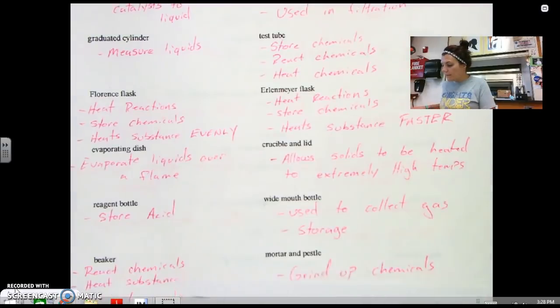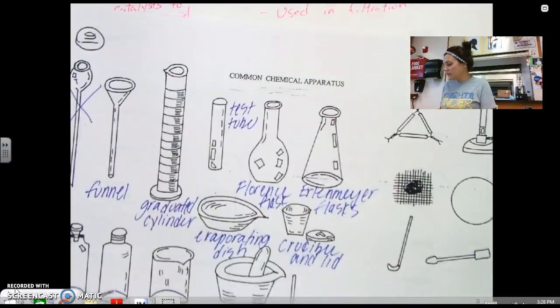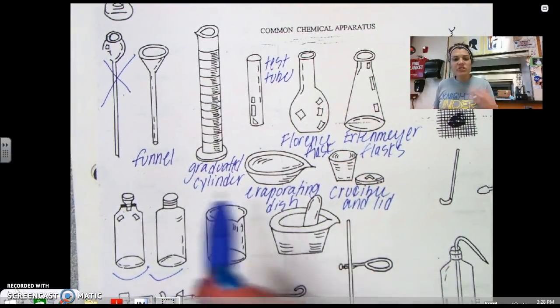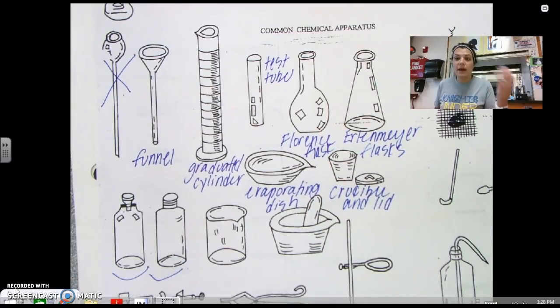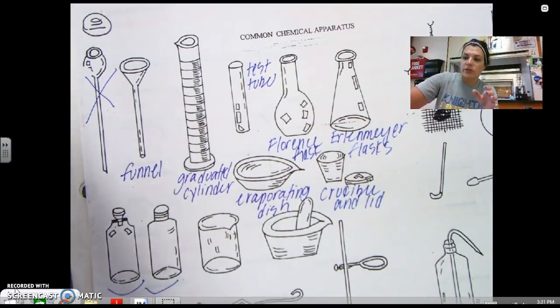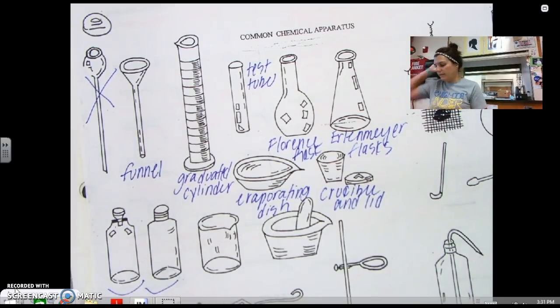These next two things is a reagent bottle and a wide mouth bottle. I'm not so concerned that you guys know these two by name. But just realize that if you see a bottle, more than likely it has chemicals in it, especially if you're inside of the chemistry lab. And most of the time, these guys will be labeled. This would obviously hold something that can't be in touch with light. And that's why it's a darker bottle. But most of the time, you'll see things in here. And one thing about these bottles is if you take chemicals out, do not put it back in. You're going to contaminate my substances. So those are the two reagent bottles. But don't worry about writing anything down for them.